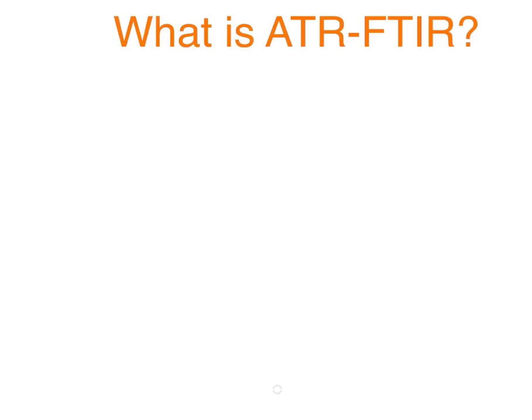Hello everyone. In this video, I'll talk about ATR FTIR and how exactly it's different from a normal FTIR or normal infrared spectroscopy. I'll talk about the theory and how light behaves in this specific condition. Well, let's go ahead and get started.